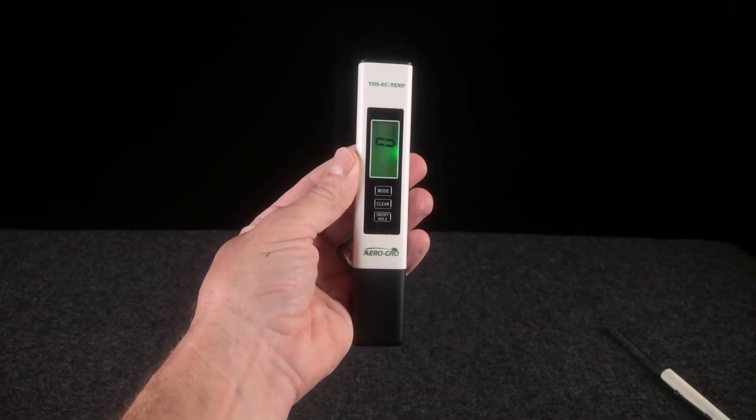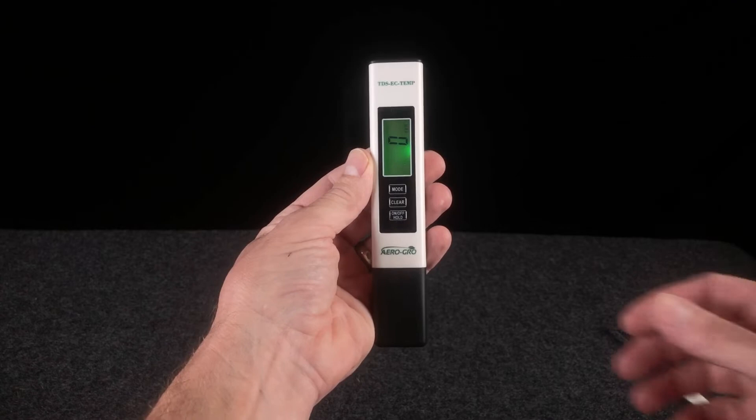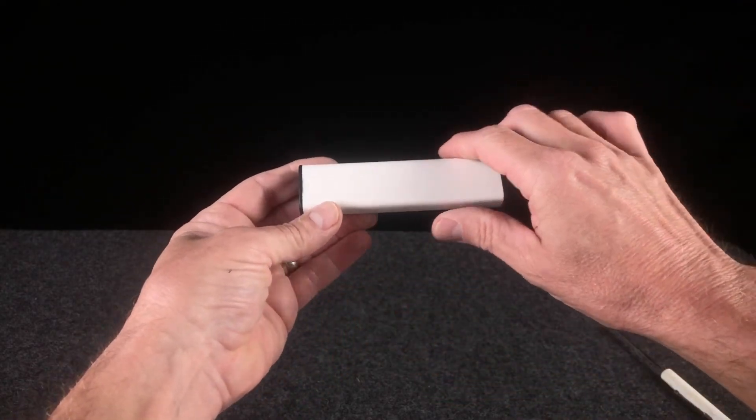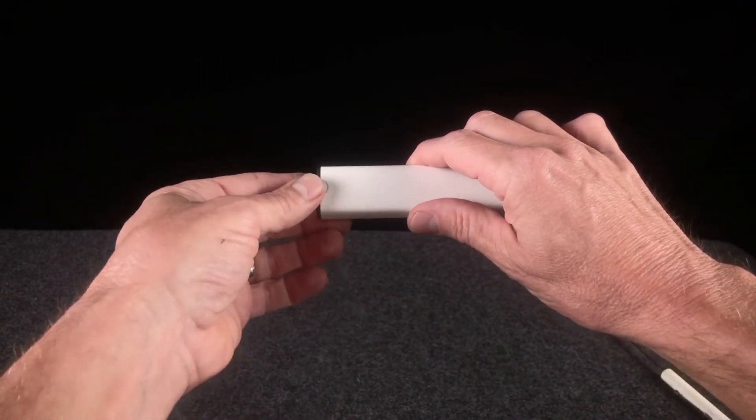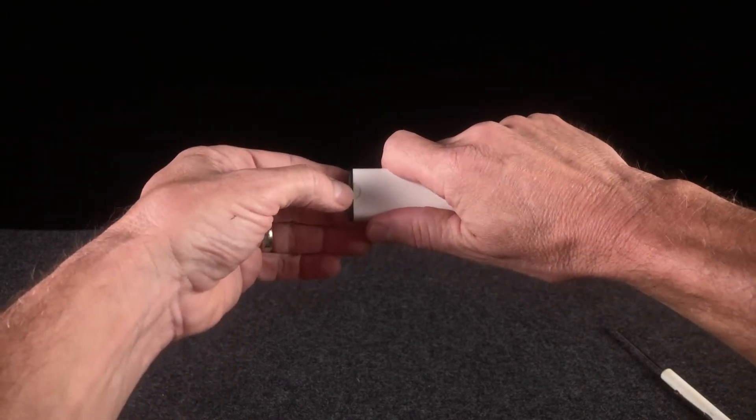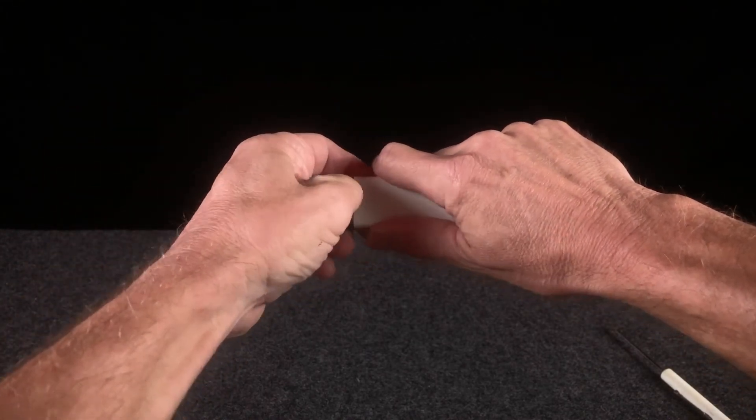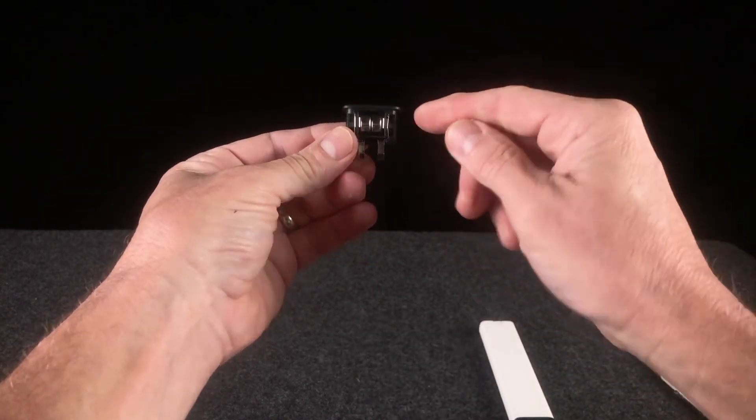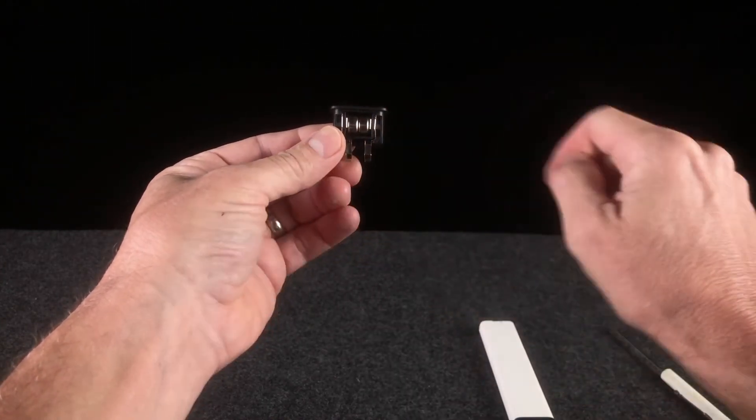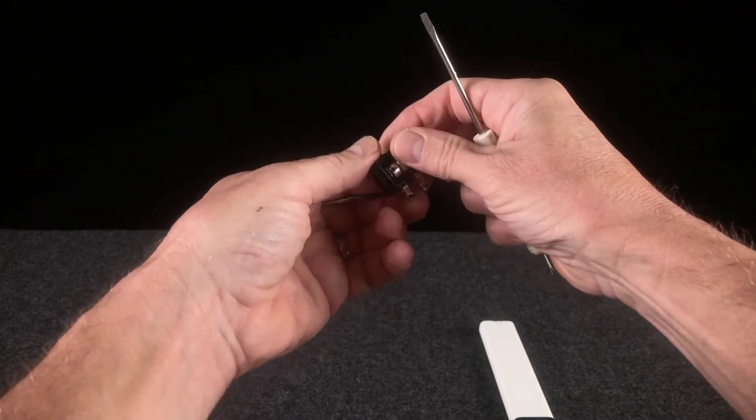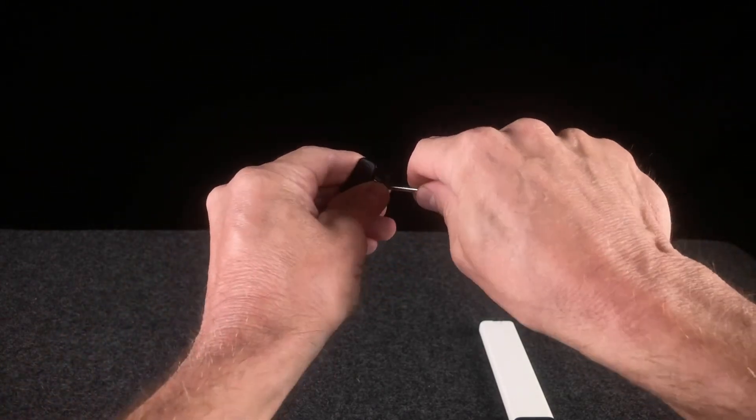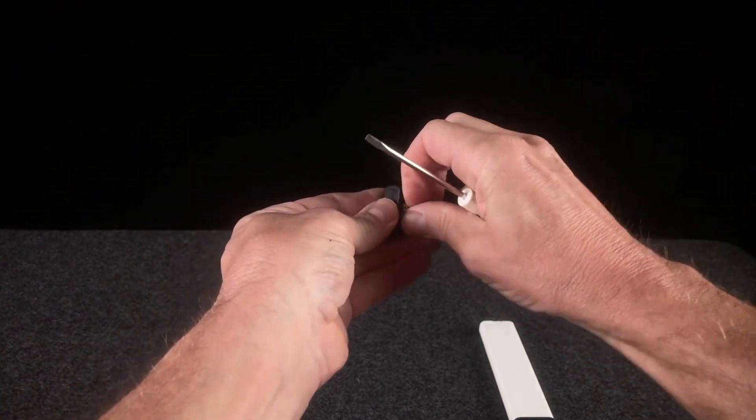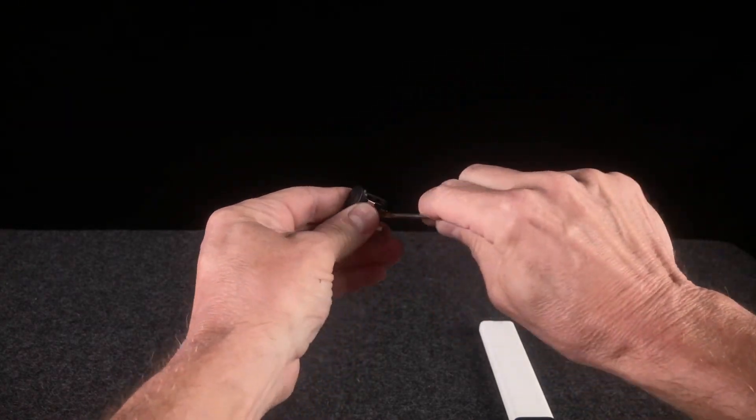Replacing the batteries in your meter is also quite easy. Simply flip the meter over and you'll notice that there's a small indent on the back. Grab the meter firmly with one hand and using your thumbnail, pry out the battery compartment. The battery compartment contains two LR44 batteries. So then using a small tool like a screwdriver, simply pry the batteries out, carefully.